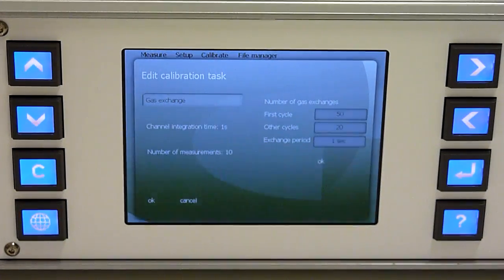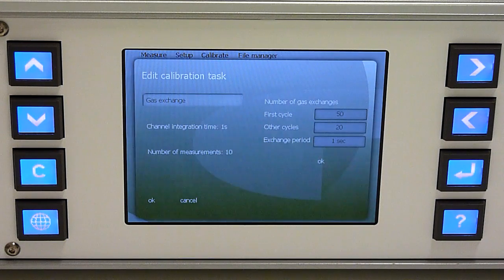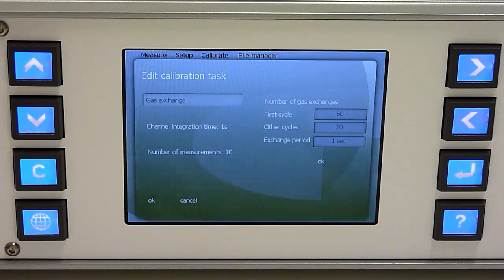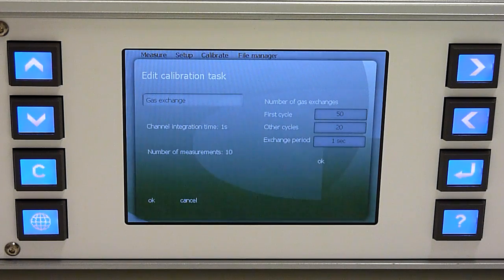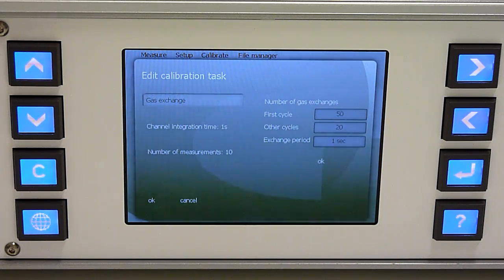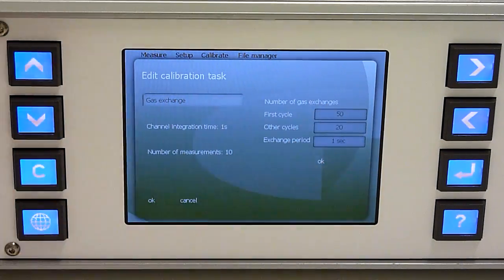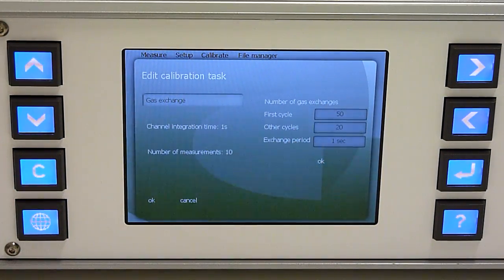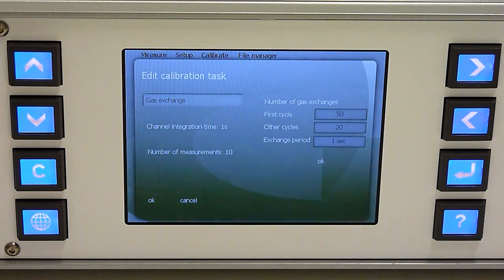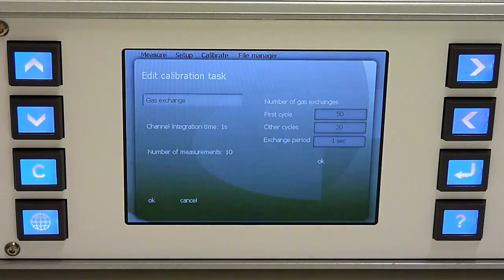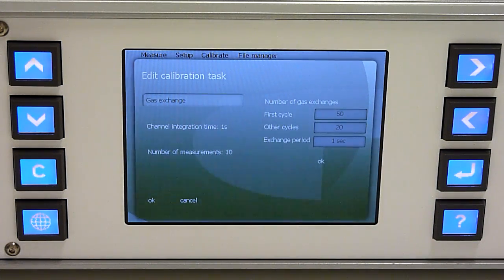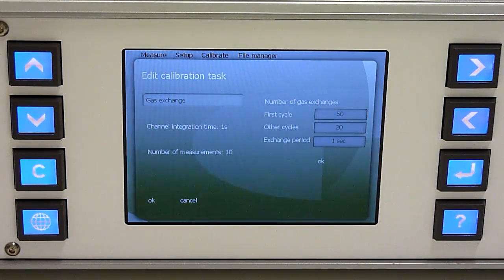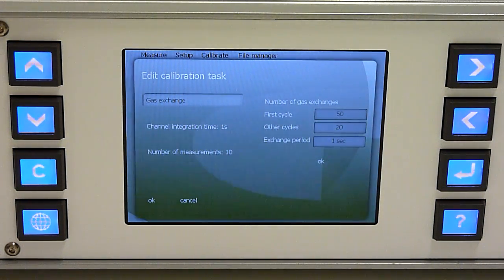Calibration task definitions are quite similar to the definitions for the measurement task. Here it is important to set excess parameters for gas exchange because during the calibration it's very important to completely flush the gas cell with fresh sample of the calibration gas before running the calibration.